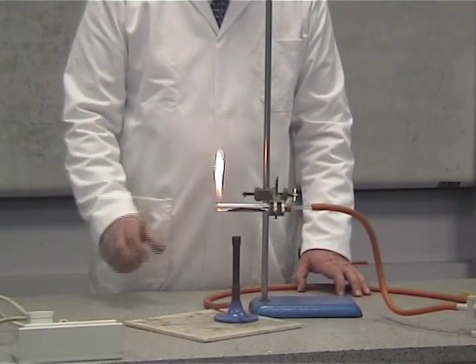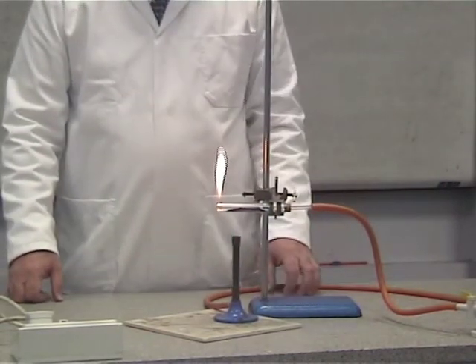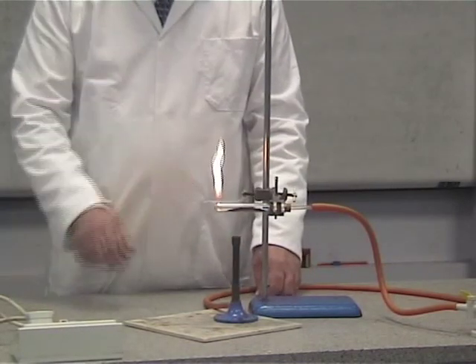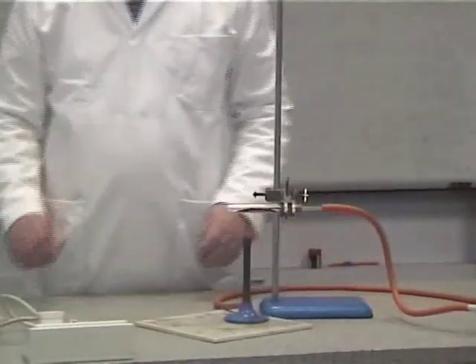The other thing is, you're going to have to wait about maybe 5 or so minutes and just check at the end of the tube that it's safe to actually hold. Once it's safe for them to hold, you can then tell them to switch off the gas, and then you can then take that over and reweigh it again.